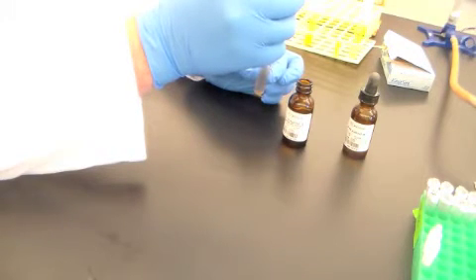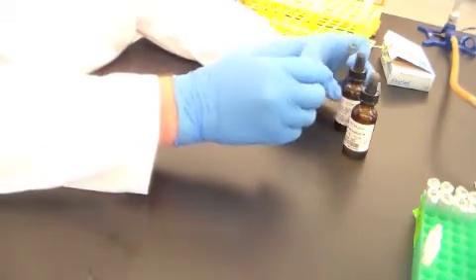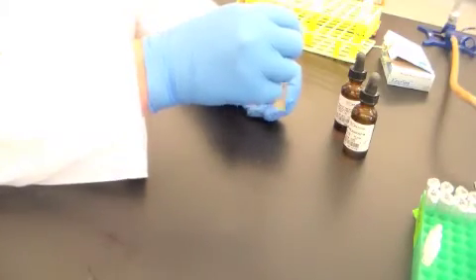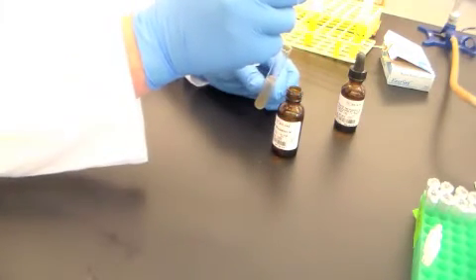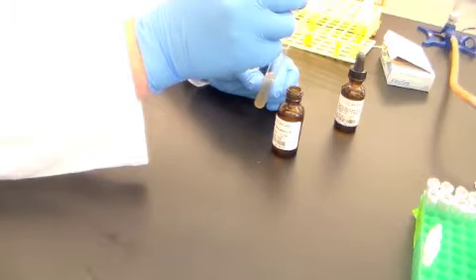1, 2, 3, 4, 5. Let's go 6. I unfortunately went to that school that said if a little is good, a lot is better. Doesn't really work. And then nitrate reagent B. 1, 2, 3, 4, 5, 6.